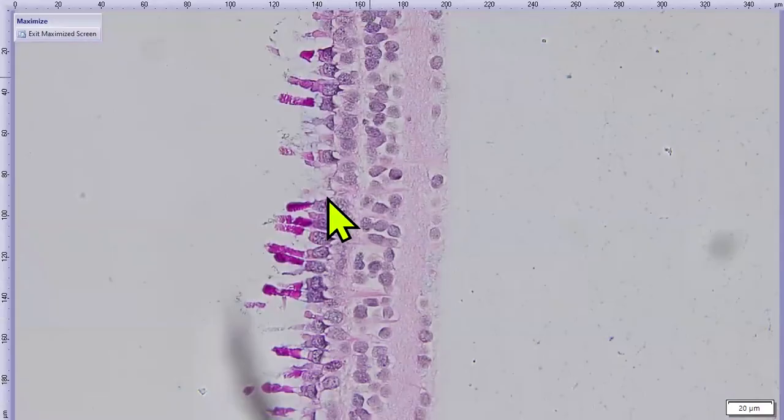Notice how thin the outer nuclear layer is. And this is why I think that the schematic about identifying nocturnal versus diurnal differentiation by looking just at the retina doesn't hold so much for amphibians and reptiles.